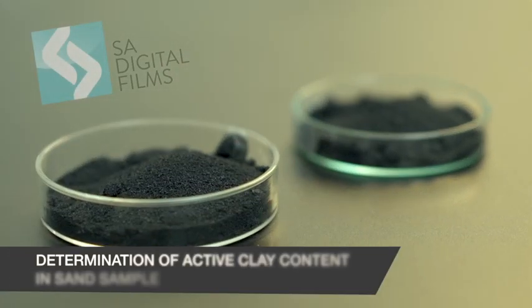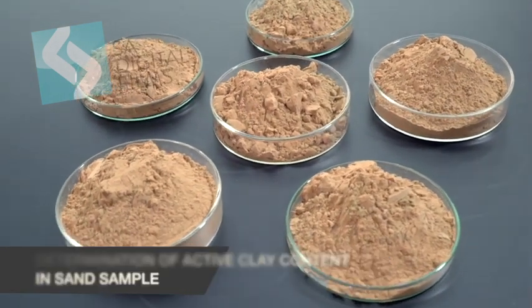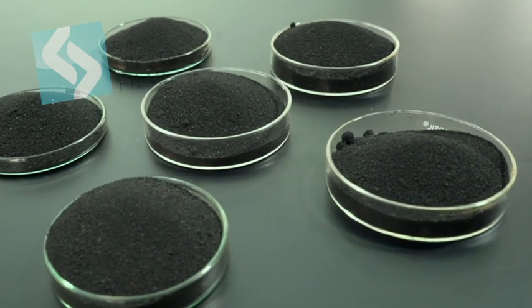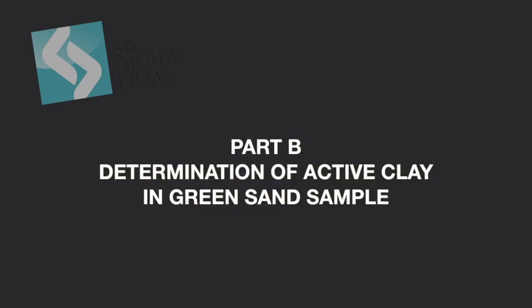The objective of this tutorial is to determine the active clay content in the sand sample. It consists of Part A, determination of MB value of bentonite, and Part B, determination of active clay in green sand sample.